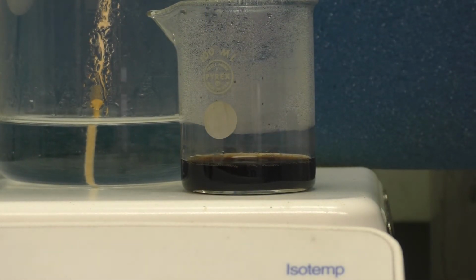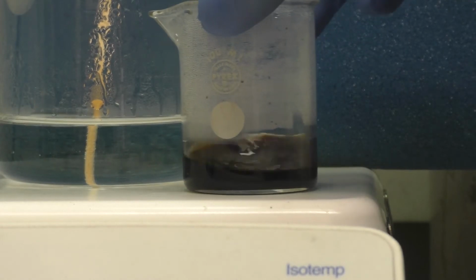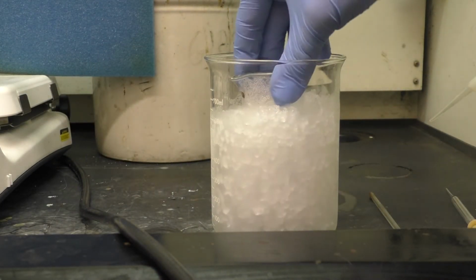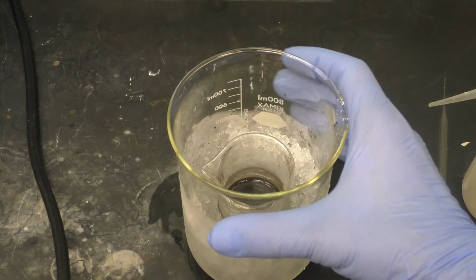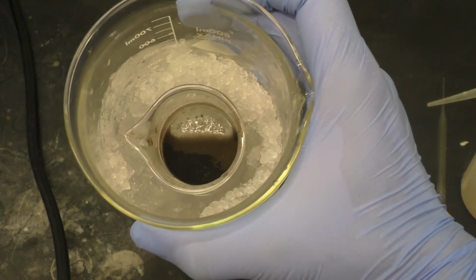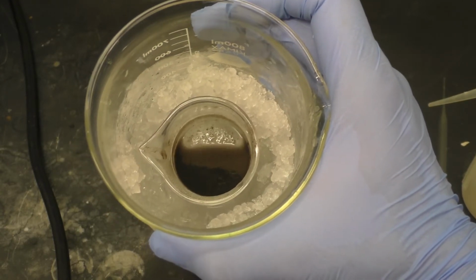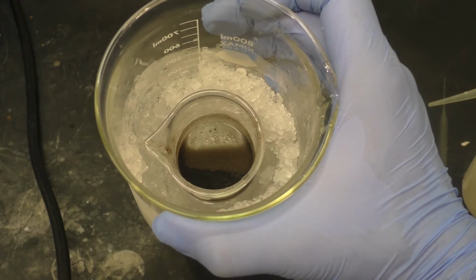So I'm going to take this and remove it from the hot plate, let it cool, and then put it in an ice bath and see if we can get some crystalline material to form. Alright, so it looks like we actually got quite a bit of solid material here, a little bit tough to see, but some right in there along the top, and there's some in the bottom. So let's take this over and collect it by filtration. See what we get.